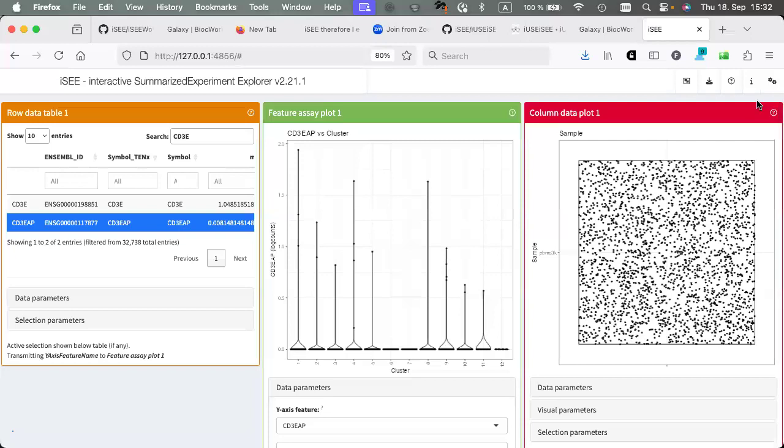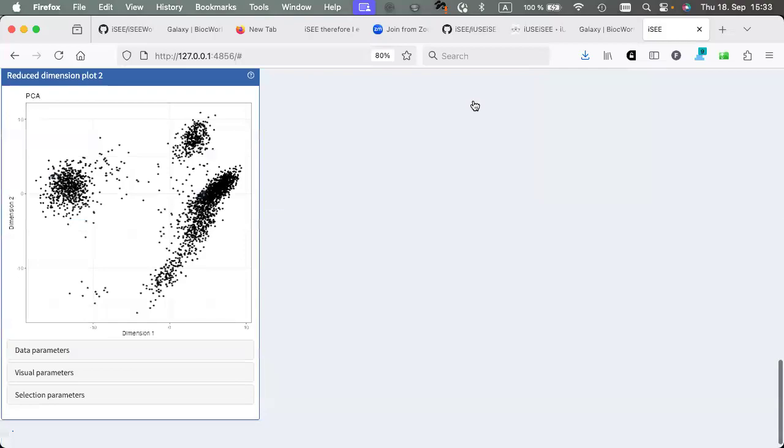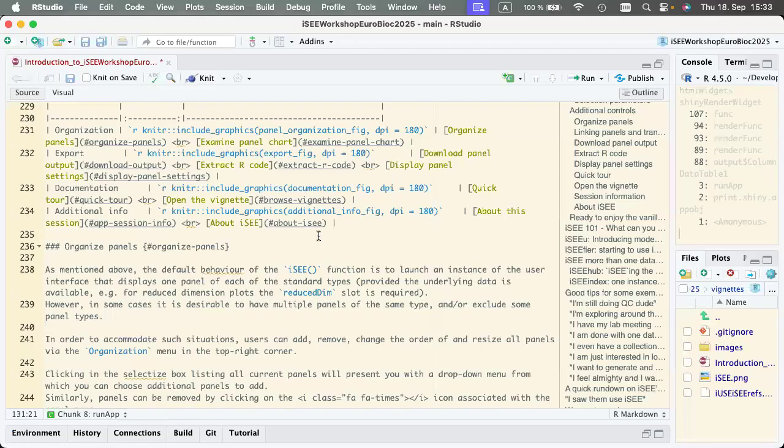And then again, it's to put all things into one place, and iSEE can also read that for you. There's that, and there's the button that, I don't know if it's dangerous to click on, but if you want, you can stop and kill the app. But not for the sake of this workshop, at least. Okay. Let me see what comes next.